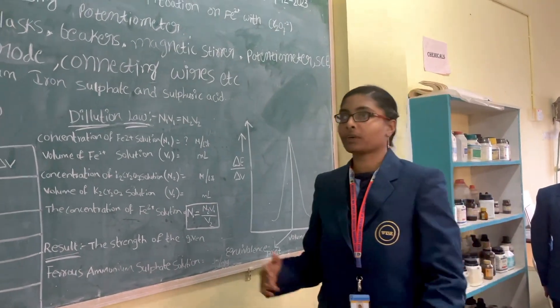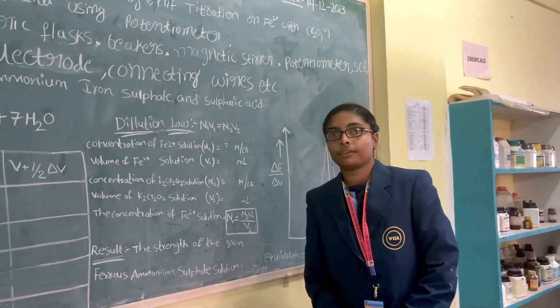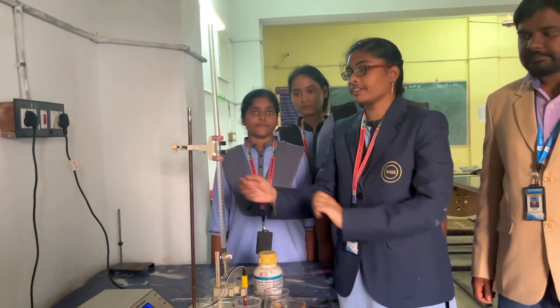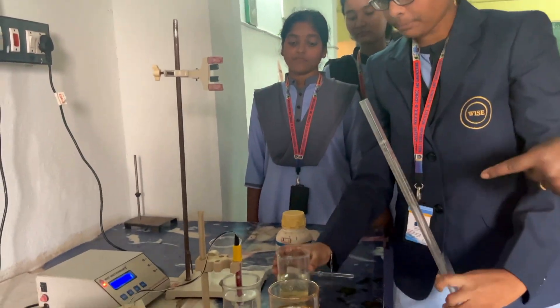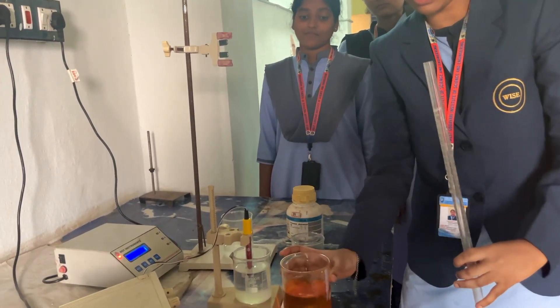This is the procedure of this experiment. Let's meet in the experiment. First of all, we have to take the burette and fill it with potassium dichromate.